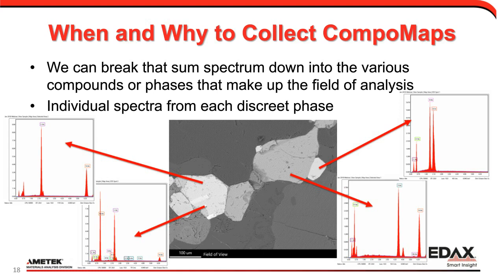Now we could see that each individual spectrum is not quite as complex. We don't have all elements in each spectrum. We just seem to have spectra with a few, 2 or 3 peaks in each one of them. And note this sample is carbon coated, so that's usually always going to be in there. And for some of you geologists, you're probably already starting to look at some of the overlaps that you might see.